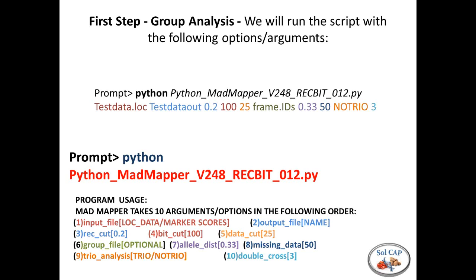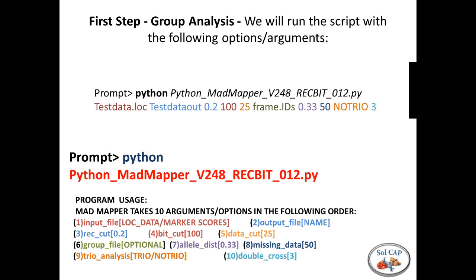The trio analysis is basically a triplet analysis. You can do pairwise analyses for grouping or triplet analyses for grouping. For a first pass, we really want to just do a pairwise analysis, so we put in no trio. You want to use no trio also because it's much quicker — you're just looking at pairwise comparisons as opposed to all possible triplet comparisons. You can also put in a maximum number of double crossovers you're going to allow in the grouping process; we recommend three. All of this is explained in more detail in the README file available when you click the MADMapper link.